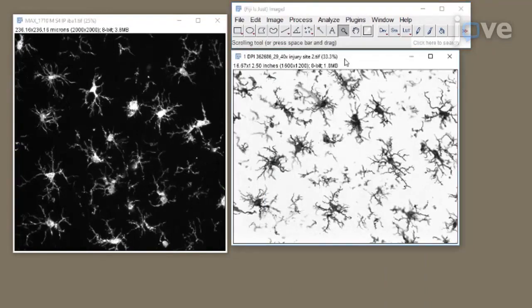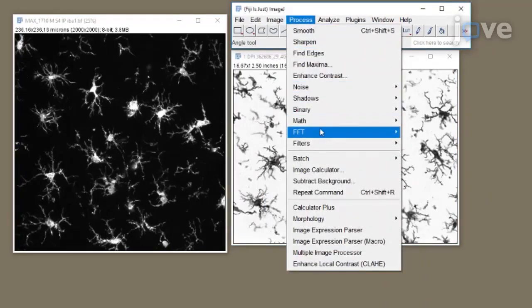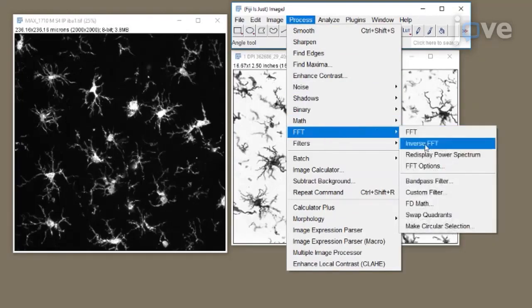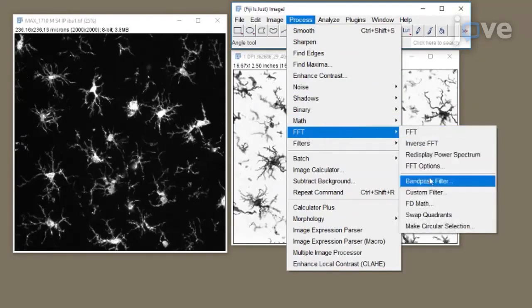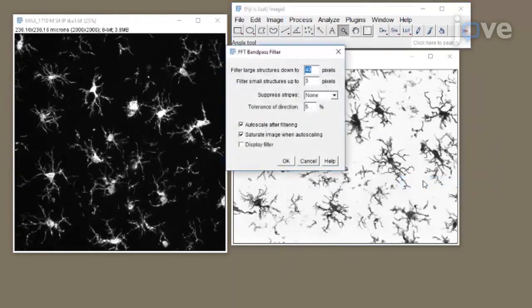If using a DAB brightfield photograph, first use the FFT Band Pass Filter plugin with the default settings. Click Process, FFT, Band Pass Filter, and then convert to grayscale.